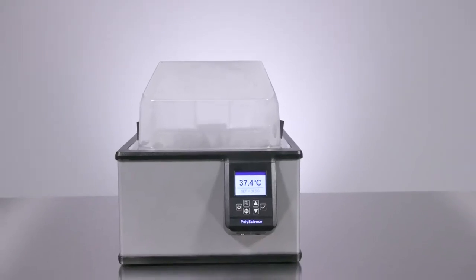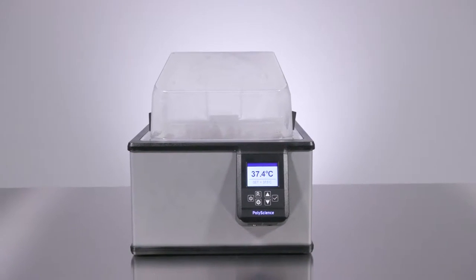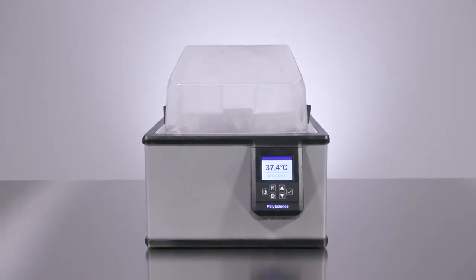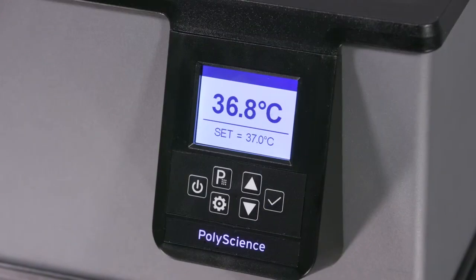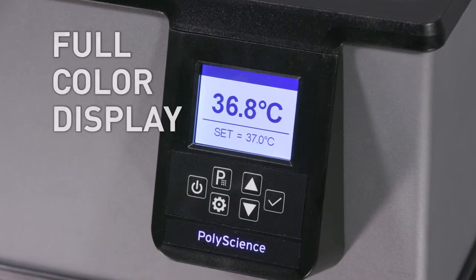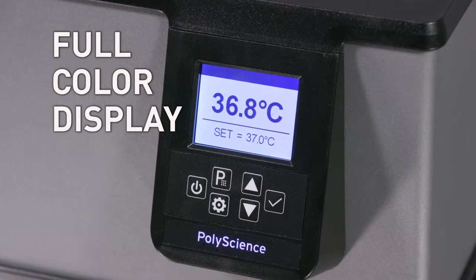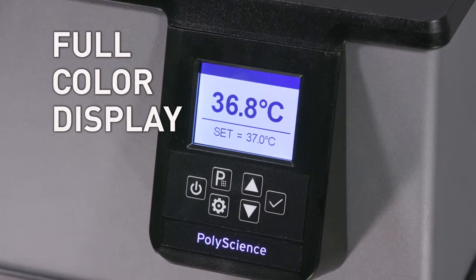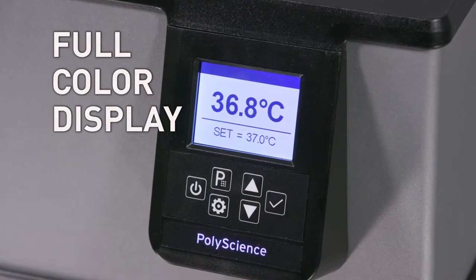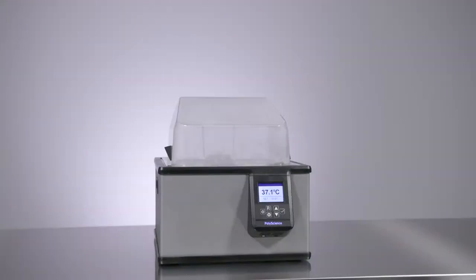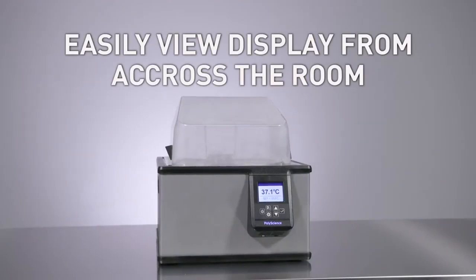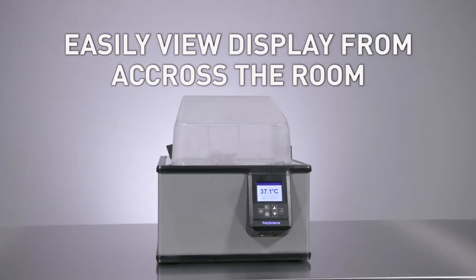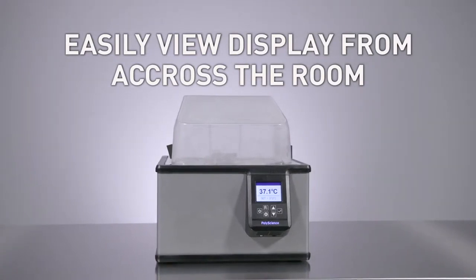The new PolyScience water baths are the first baths on the market to utilize a full-color TFT display that provides improved contrast and the ability to easily view the display from across the room.